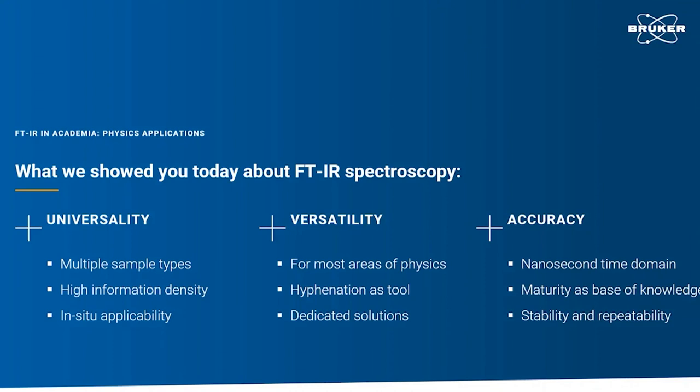So that's it, basically. Today, we highlighted the universality, versatility, and accuracy of infrared spectroscopy and scratched the surface of what's possible. What you should take with you is that FTIR is not only a tool for chemistry, but is also widely applicable in physics studies for time-resolved spectroscopy. It is indispensable for development and characterization of new optical materials or devices. It contributes a lot, not only in basic research field, but also in semiconductor industry quality control.